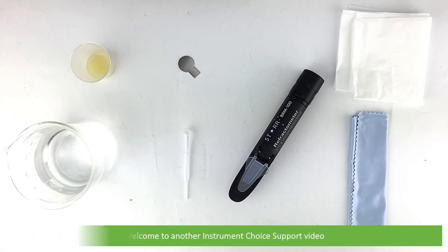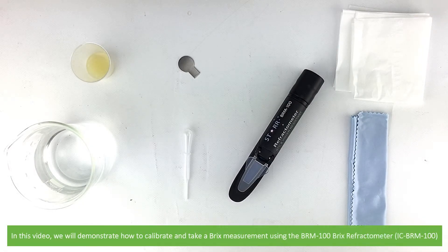Hi and welcome to another Instrument Choice Support video. In this video we'll demonstrate how to calibrate and take a Brix measurement on the BRM100 Brix Refractometer.